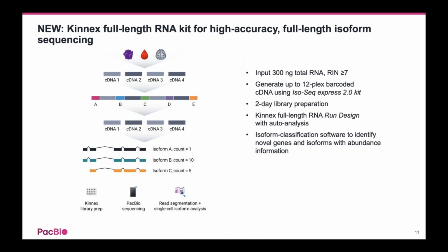So for bulk or full-length RNA sequencing, which Kim will discuss in her talk, we also leverage the same concatenation method that I described for the MAS-Seq kit to get higher throughput. Since the transcript lengths are typically shorter than HiFi long reads, concatenating cDNAs together means more transcripts per HiFi read. And we'll see a preview of this Kinnex kit data in Kim's talk today. The workflow for this kit is similar to that of the single-cell workflow, but without the upfront 10x cDNA prep.